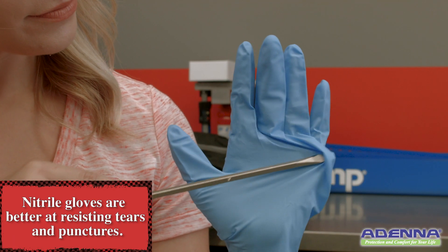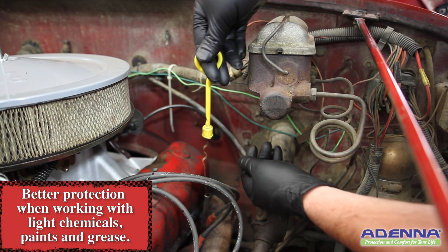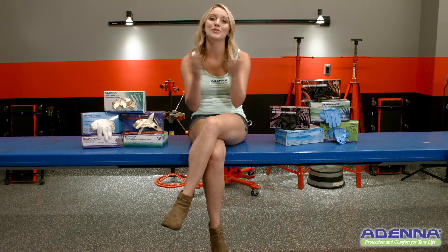Nitrile gloves are generally considered better at resisting tears and punctures. They are also better at protecting your hands when working with light chemicals, paints, and grease. Adena carries a full line of gloves in both latex and nitrile, in a variety of colors, thicknesses, and fitments. Let us protect your most important tools — your hands.